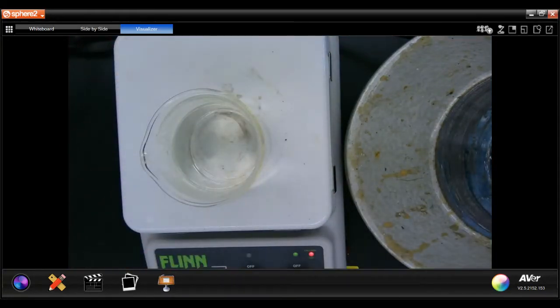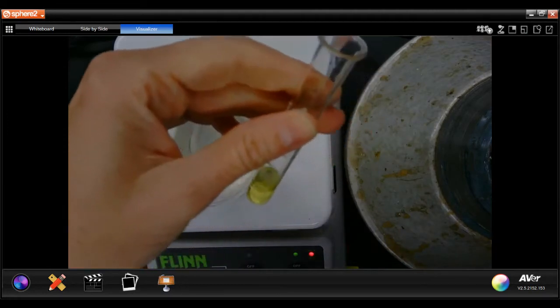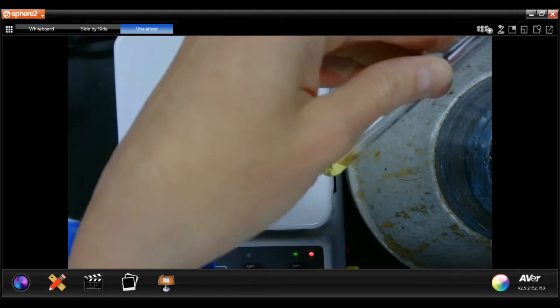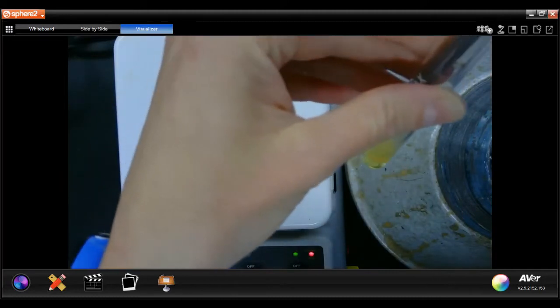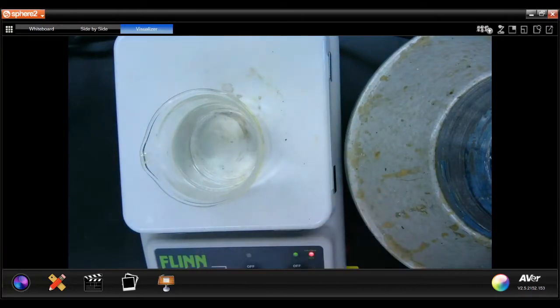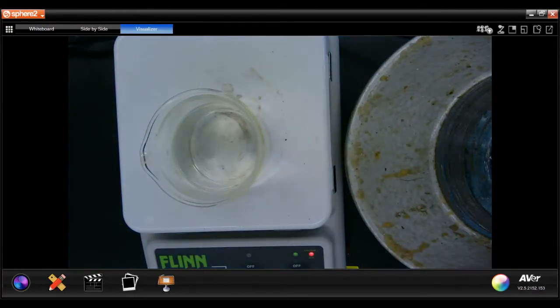I'm going to test the pH with a piece of litmus paper to make sure it is basic. It is not basic, so I'm going to add some more sodium hydroxide.